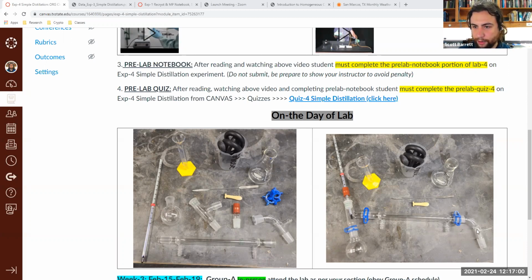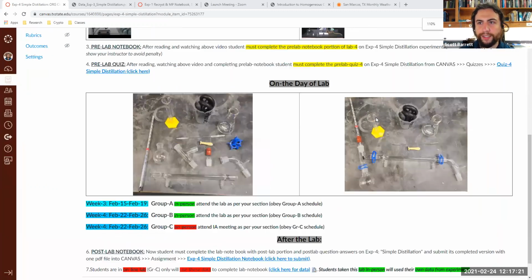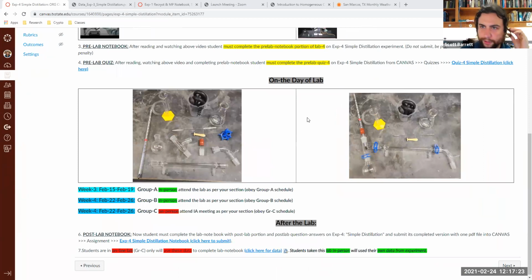And then coming over here, we have this exit adapter, which will allow our distillate to come down out at the very end. And this extra little portion here would also be utilized if we were using vacuum distillation, which is really awesome practice. However, we will not be utilizing that as much here. However, I will discuss it in the lab manual further so that everyone can get a little bit of clarification as to what the difference is.